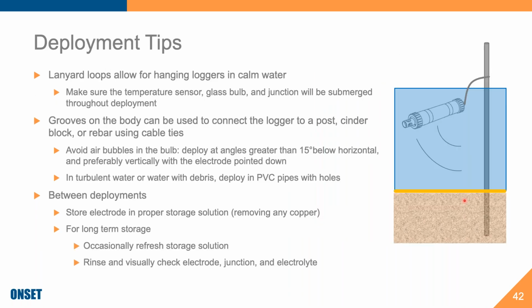Deployment tips. This is a fun one because there's some really fun applications that I've seen people doing, and some crazy ones I've seen people doing, and it's all fun. So deployment tips. The pH loggers, or data loggers, usually have a way of hanging them somehow. So I'm going to go with what I'm very familiar with, and that is our pH data logger. And that's what you see here.